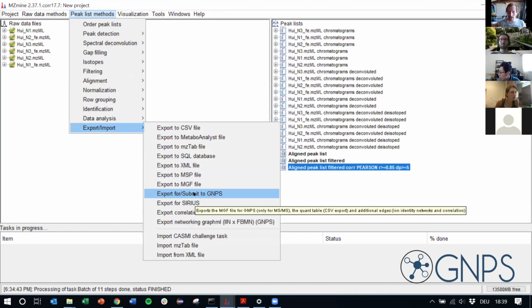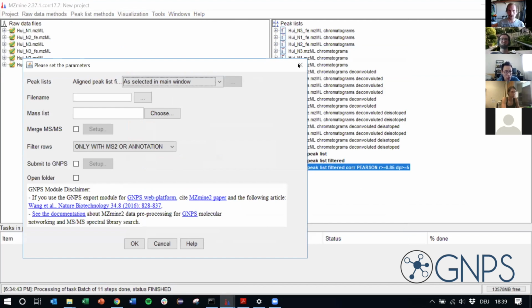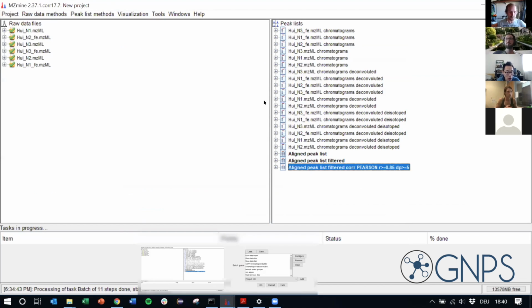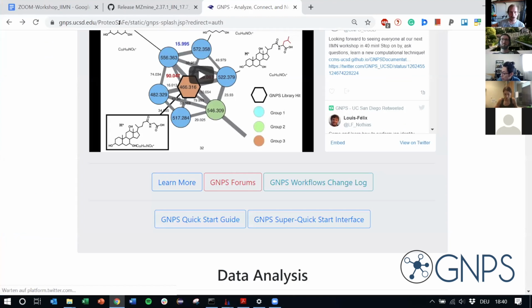And if you did not make it this far, we also got you covered, because we already pre-submitted the GNPS job before. So the next step, which Allegra is going to talk about in a second, the download and Cytoscape visualization, you can simply start from that already processed job. It would of course be great if you can keep going from your own job, but that is probably going to take like 15 minutes or so.